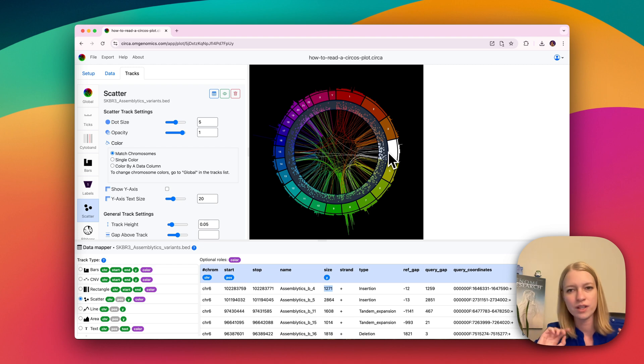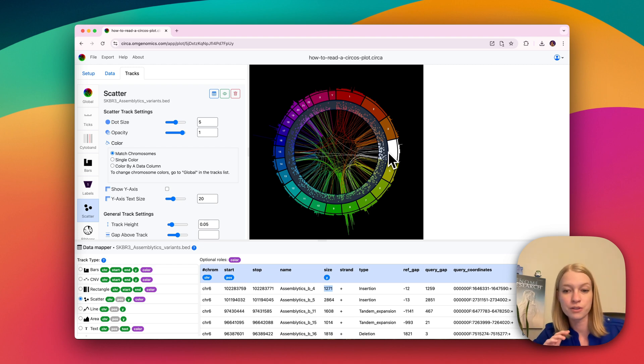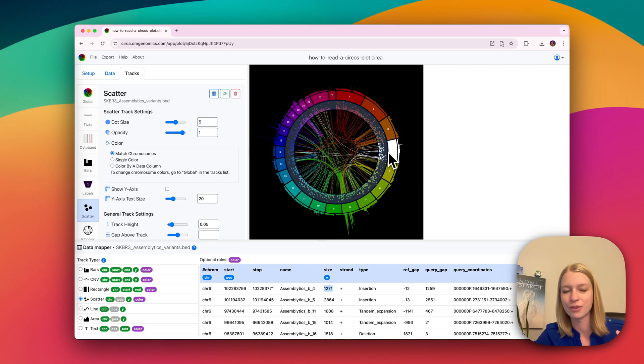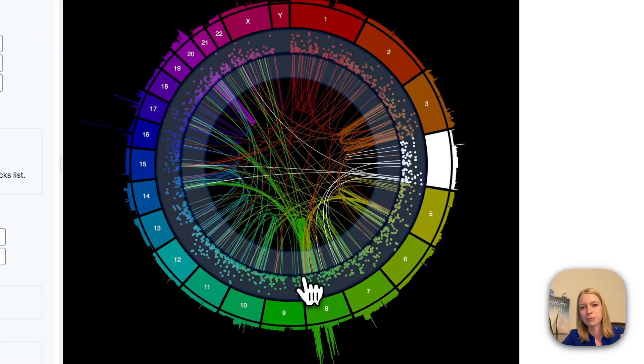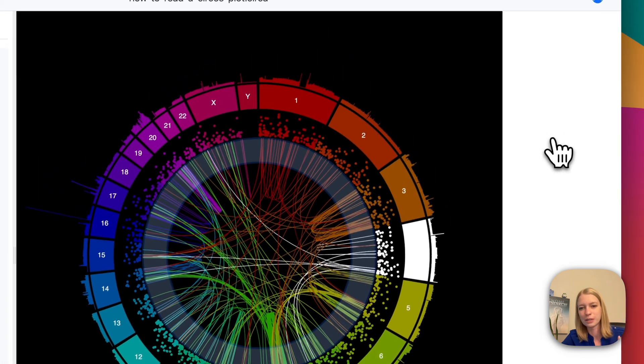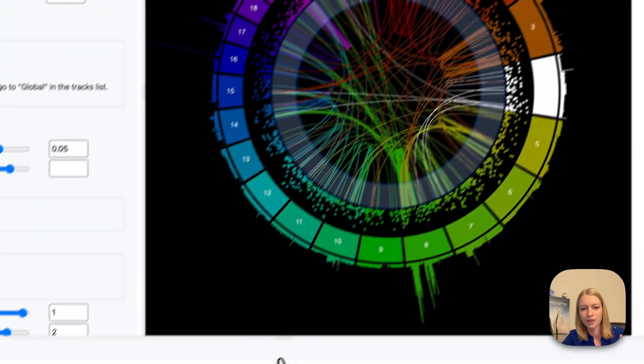One of the amazing things we can do with a Circos plot that we can't do with other types of plots is to show these connections between chromosomes. And this is really powerful.